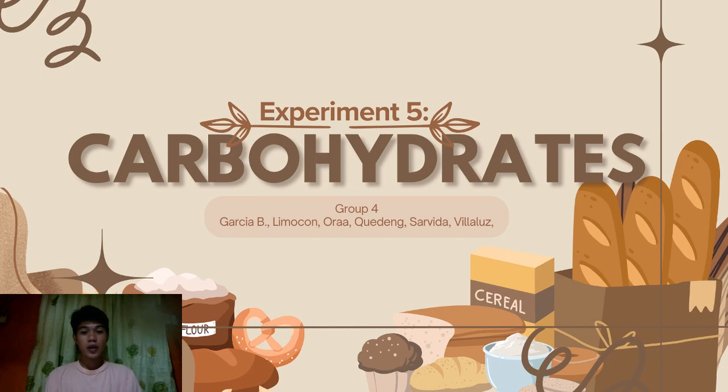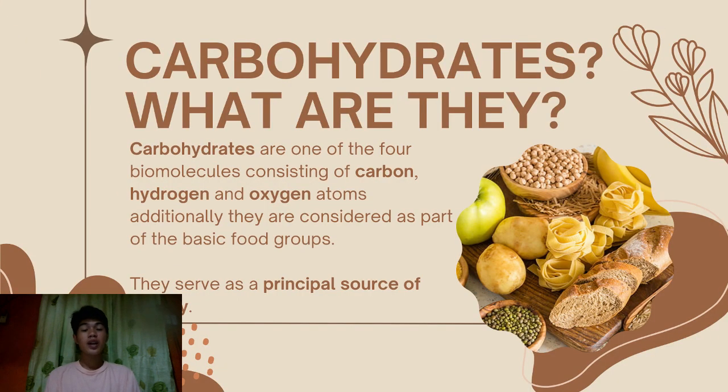This is our oral report about Experiment 5: carbohydrates. So, what are carbohydrates? Carbohydrates are one of the four biomolecules consisting of carbon, hydrogen, and oxygen atoms.